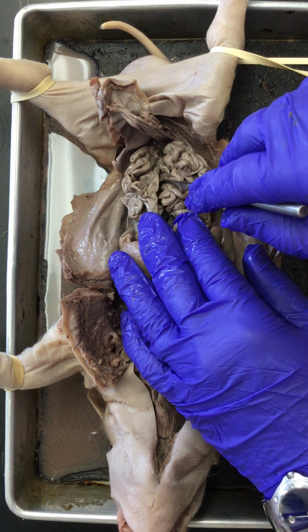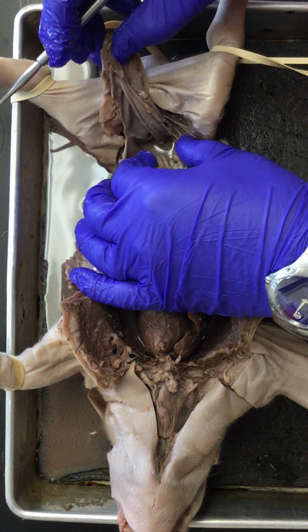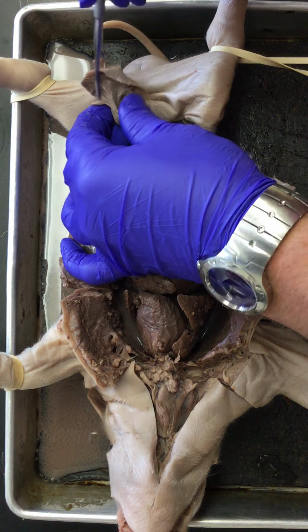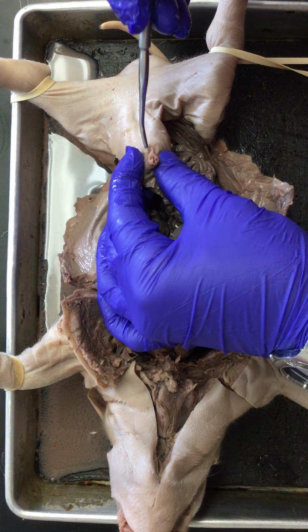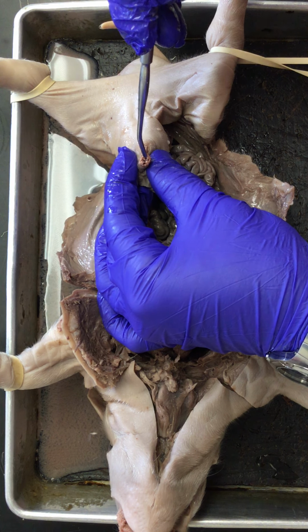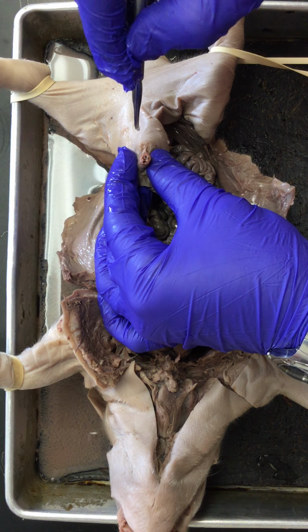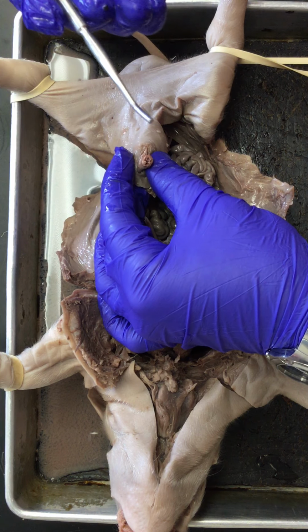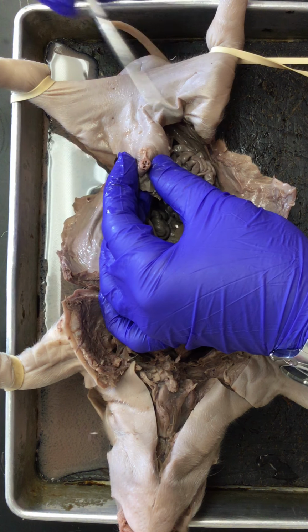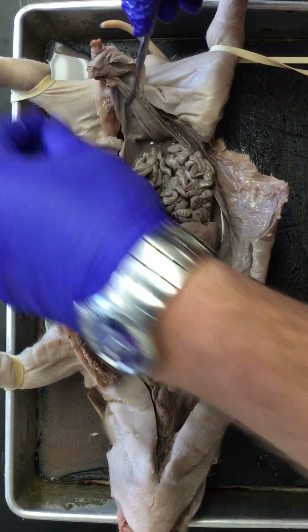So that is a fairly complete look at the internal anatomy of this pig. We've got the umbilical cord here. Inside the umbilical cord, it might actually be harder to see inside than it is this way. This way you can see these two arteries and this one vein. This is how oxygenated blood goes to the pig from its mother, and deoxygenated blood and nutrient deficient blood goes back to the mom. The mom eats and breathes, oxygenates and nutriates her blood, and sends it back to her baby. Same exact way human beings do it.